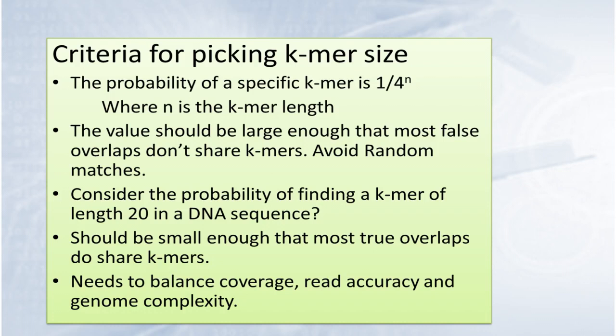The other problem with KMers is the longer they are, the more likely that KMer will include many different versions that have errors in them. And every one of those represents a KMer that will generate a spur and takes up computational space.